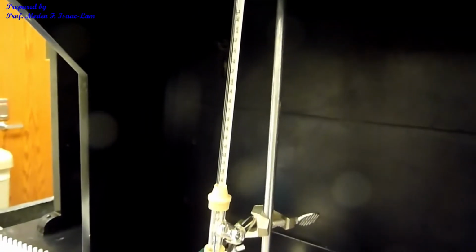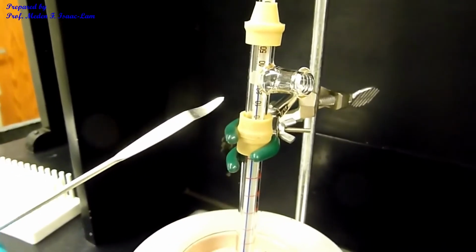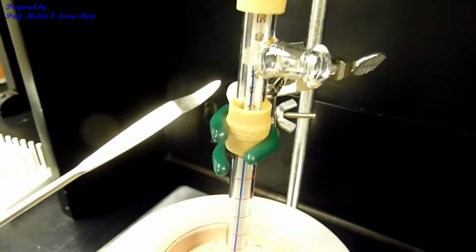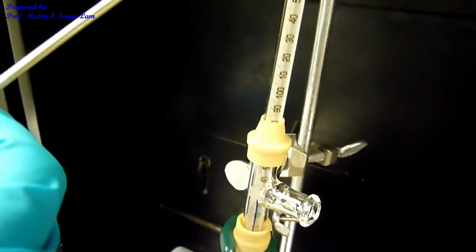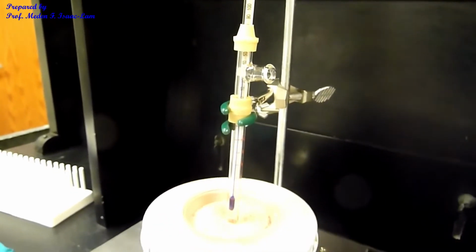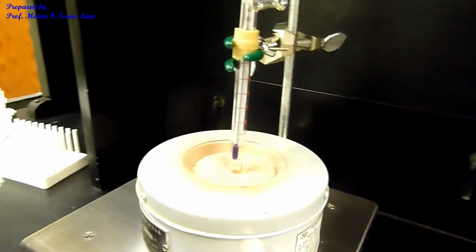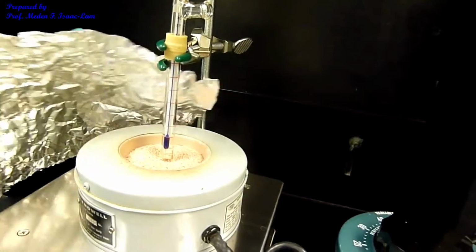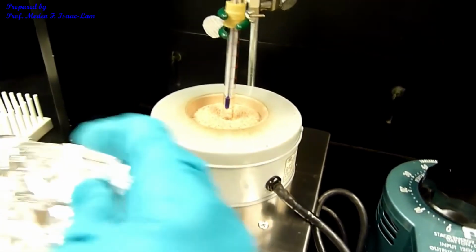And the temperature is really just about 23, 25. That's the room temperature. So we can still see it. So this is 100, and then 200 and 260. Control the heating. I'm going to shield it with aluminum foil so it can heat up fast, and to avoid any draft coming from the outside air.